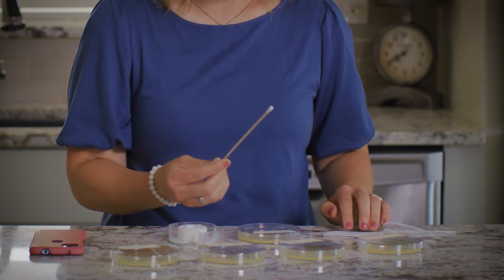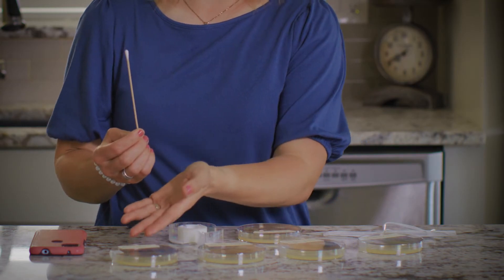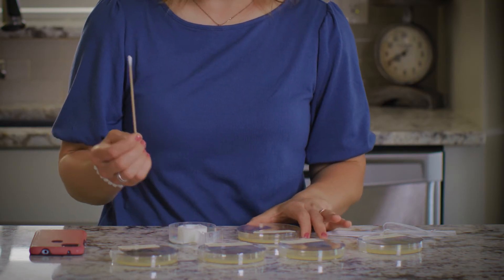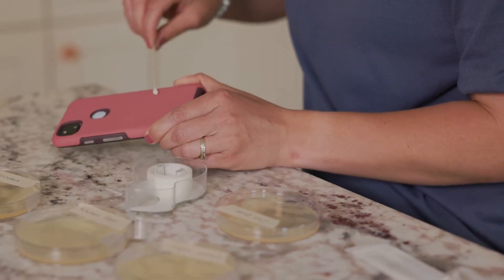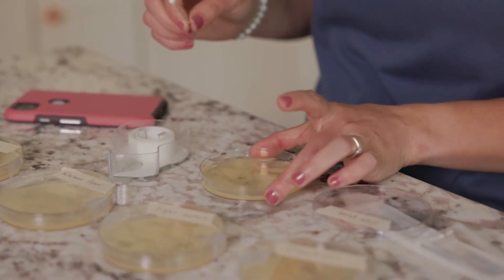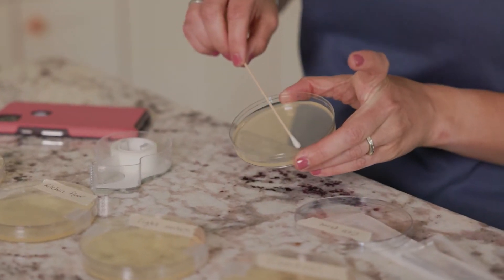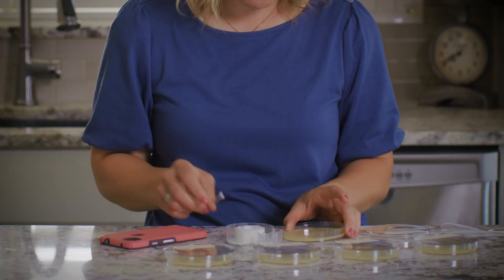I already collected samples from the floor, the light switch, and the microwave. I will show you how to collect a sample from my cell phone. Using a clean cotton swab, I will rub the cotton swab all over the surface of my phone like this. Now, I will take this swab and swipe it gently across the entire surface of the agar plate. Be careful not to tear the surface.